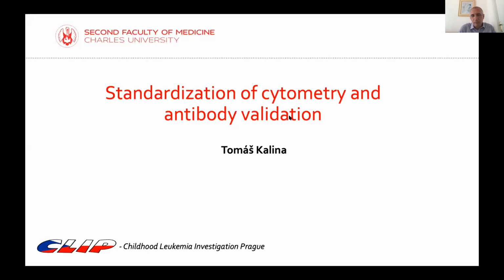This found me when I purchased a CyTOF into our institution, and I realized we need to conjugate antibodies. And I realized how difficult it is to find a good antibody and how difficult it is to realize whether we use a correct antibody or not, if we succeeded in conjugation or not. So through this, I learned quite a few things that I want to share with you today.